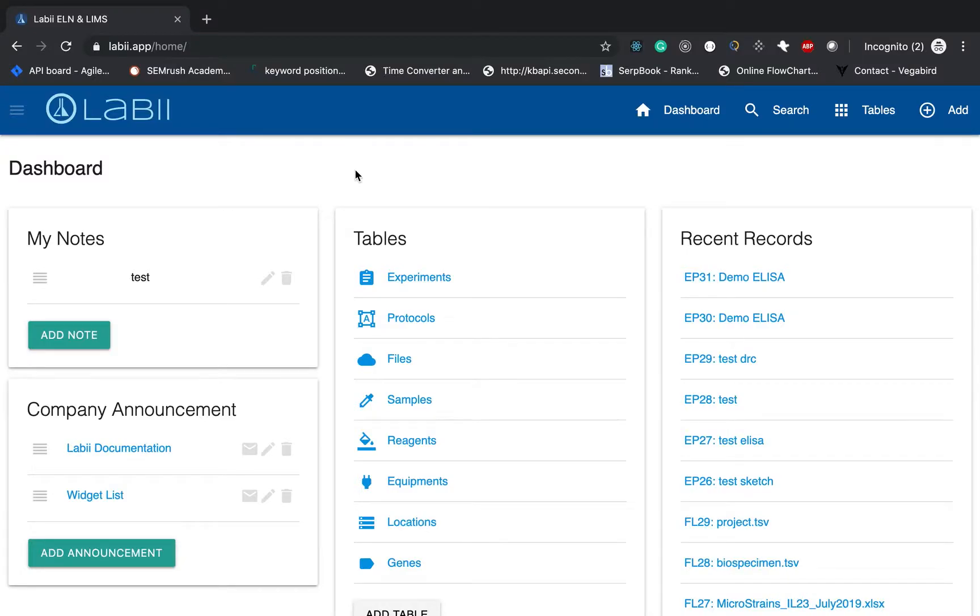Welcome to Libby, ELN, and LIMS. Today I'm going to show you how to do ELISA standard curve data analysis directly inside Libby.